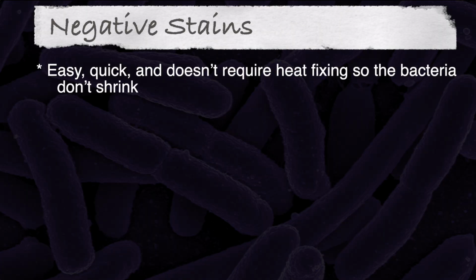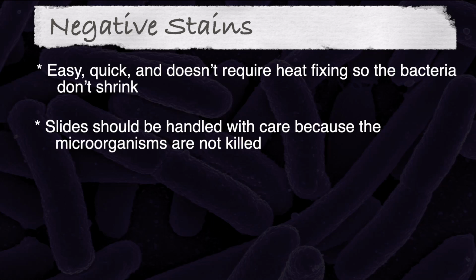Negative stains are easy, quick, and do not require heat fixing, so the bacteria don't shrink. Slides should be handled with care because the microorganisms are not killed.